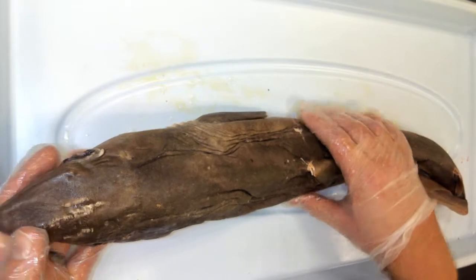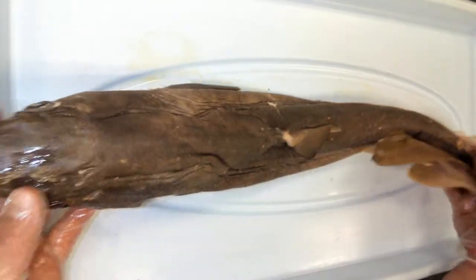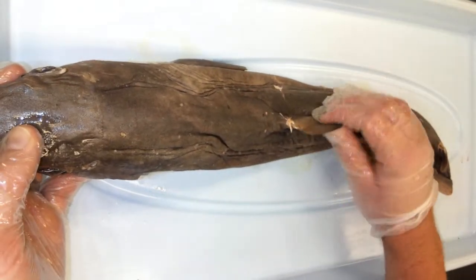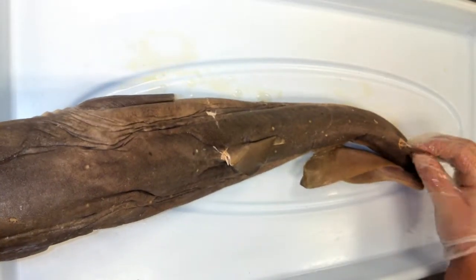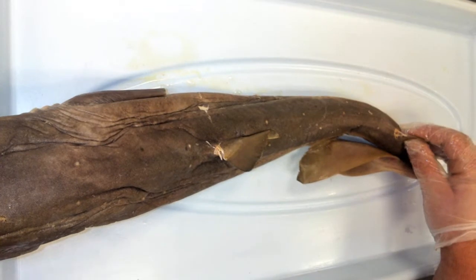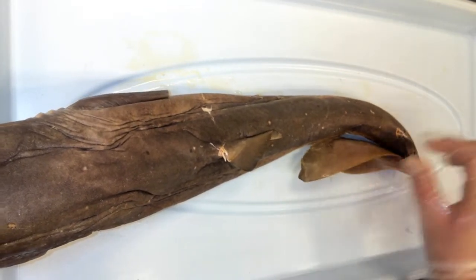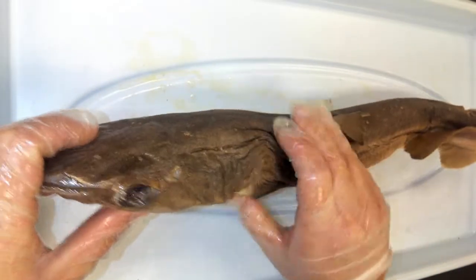What I want to do today is go over all the external structures of this shark, starting with its fins. This shark has about seven fins. It has two dorsal fins — that means on top of its body — so it has an anterior dorsal fin and a posterior dorsal fin.